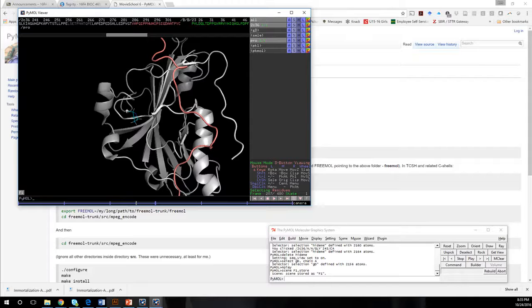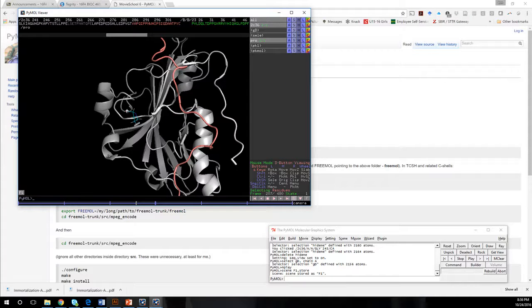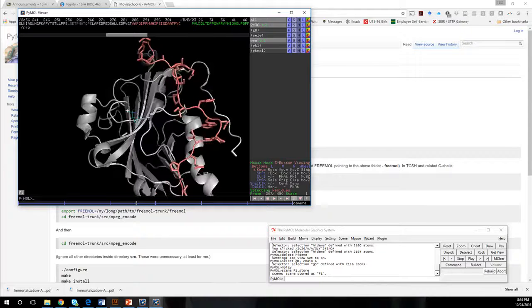And then I'm going to show some side chains as sticks. Oh, I chose the wrong one. Okay. So let me come back over. I did not mean to do a GD. Let's do hide side chains. Boom. Okay. I actually wanted to do my selection only. So side chains, sticks. And that's only going to show those on the side chain.